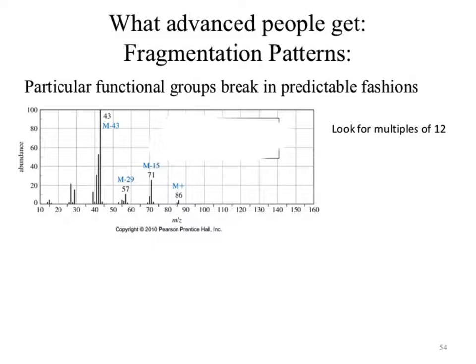Okay. We use our mass spec. We told you there's no oxygen. I had to tell you that because mass spec doesn't tell you that. We know the molecular ion is 86. Is there bromine? No. Is there chlorine? No. Is there nitrogen? No. So all of the stuff I've told you already isn't there. The lack of information is information. Write that down. What can we do with the rest of this?